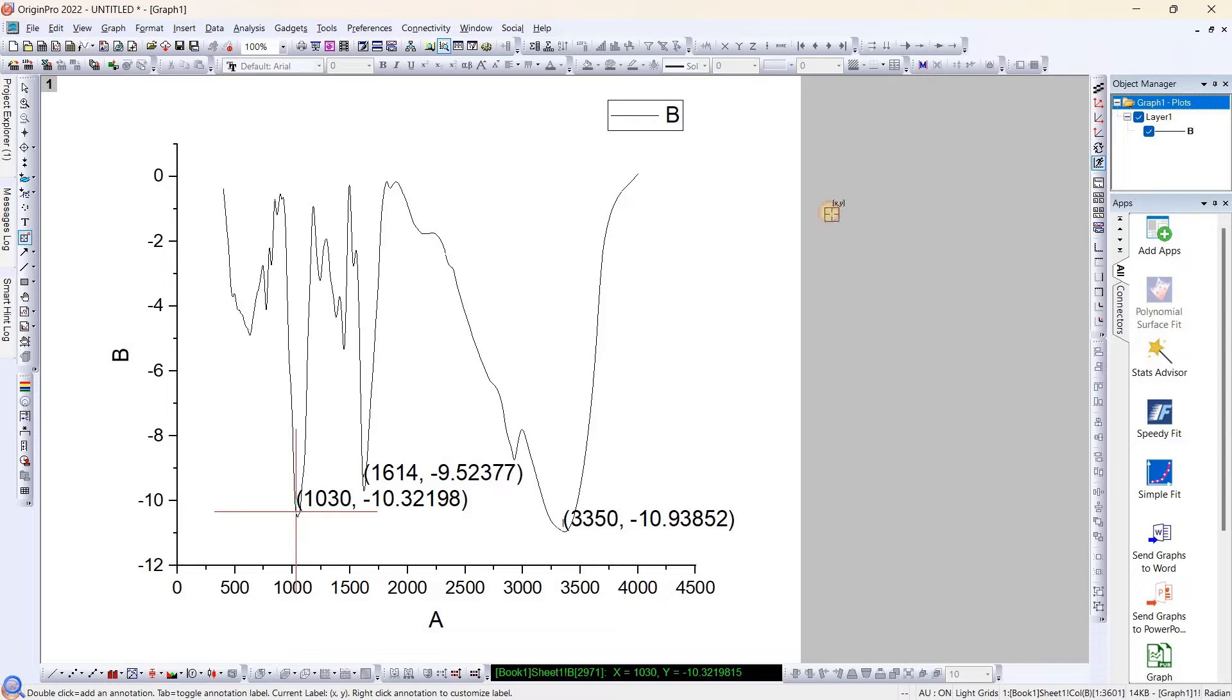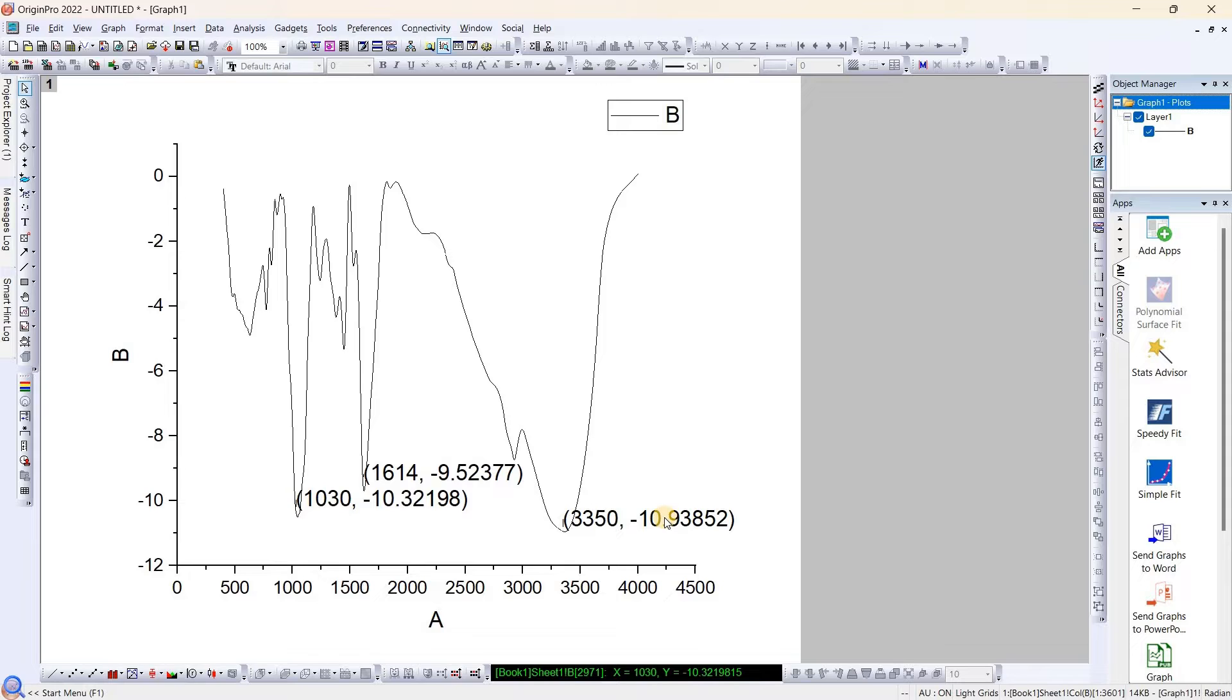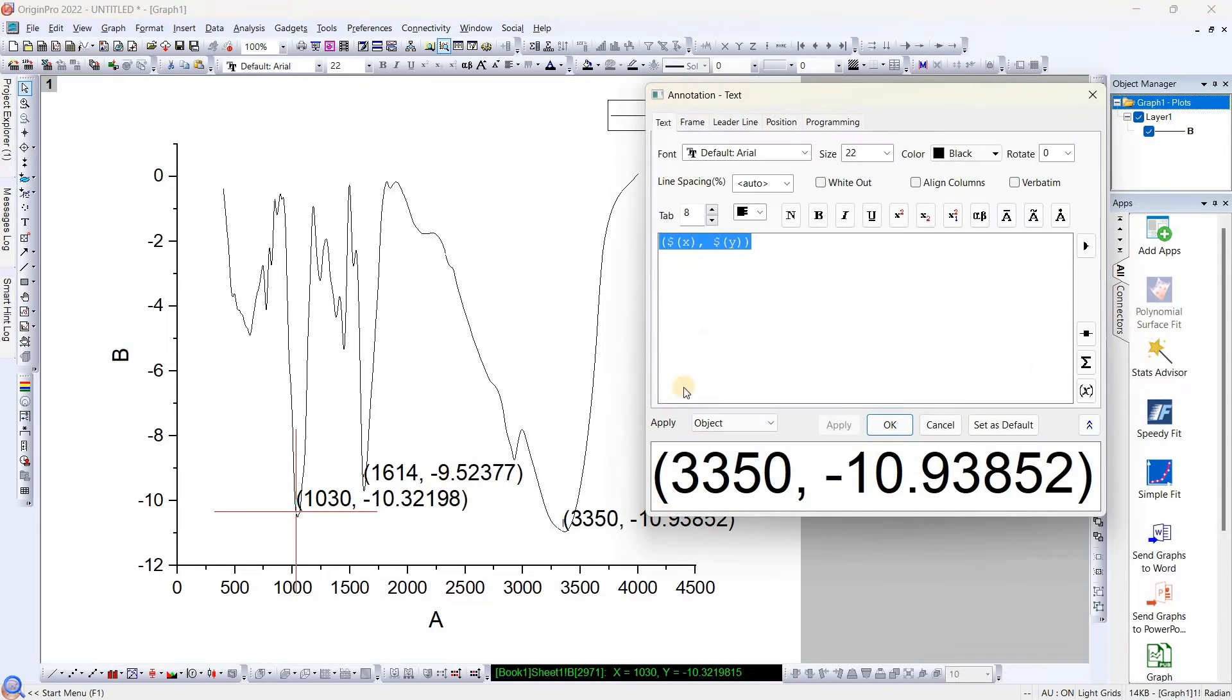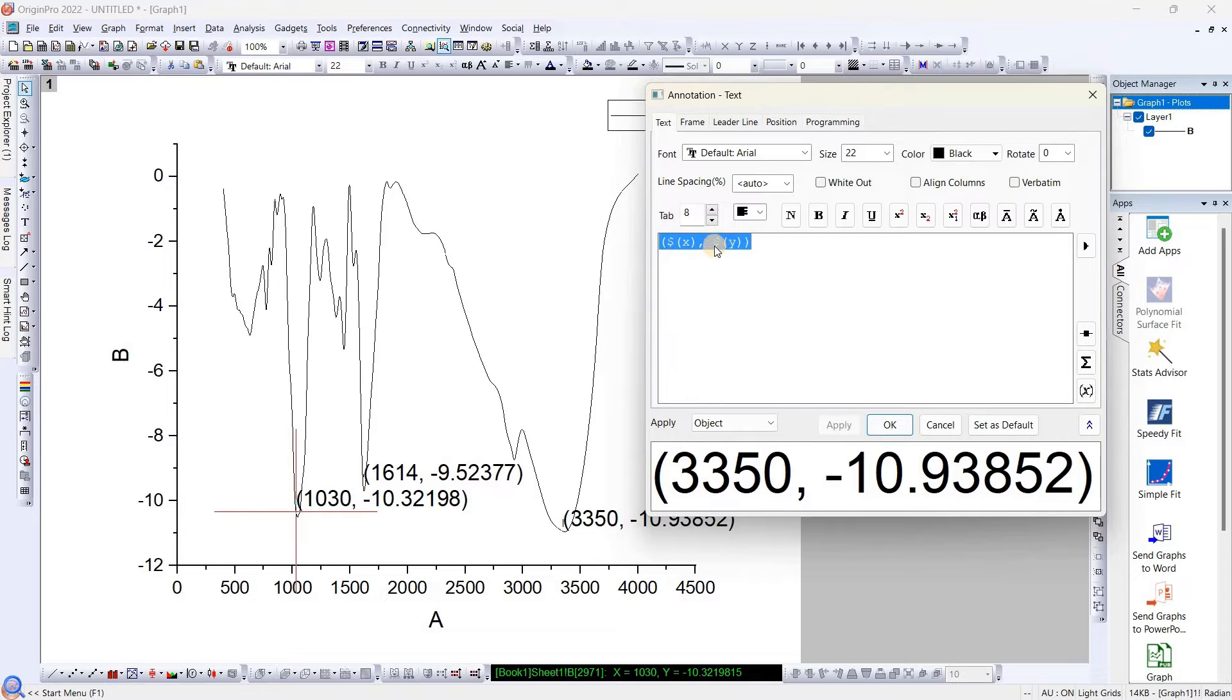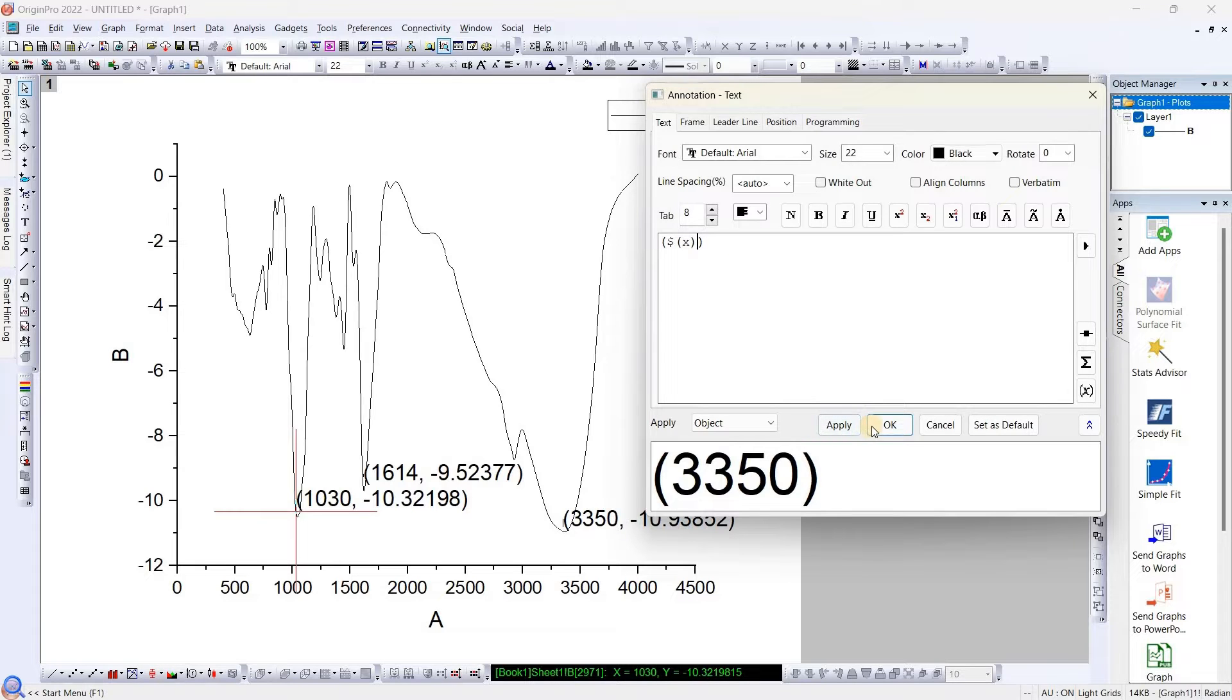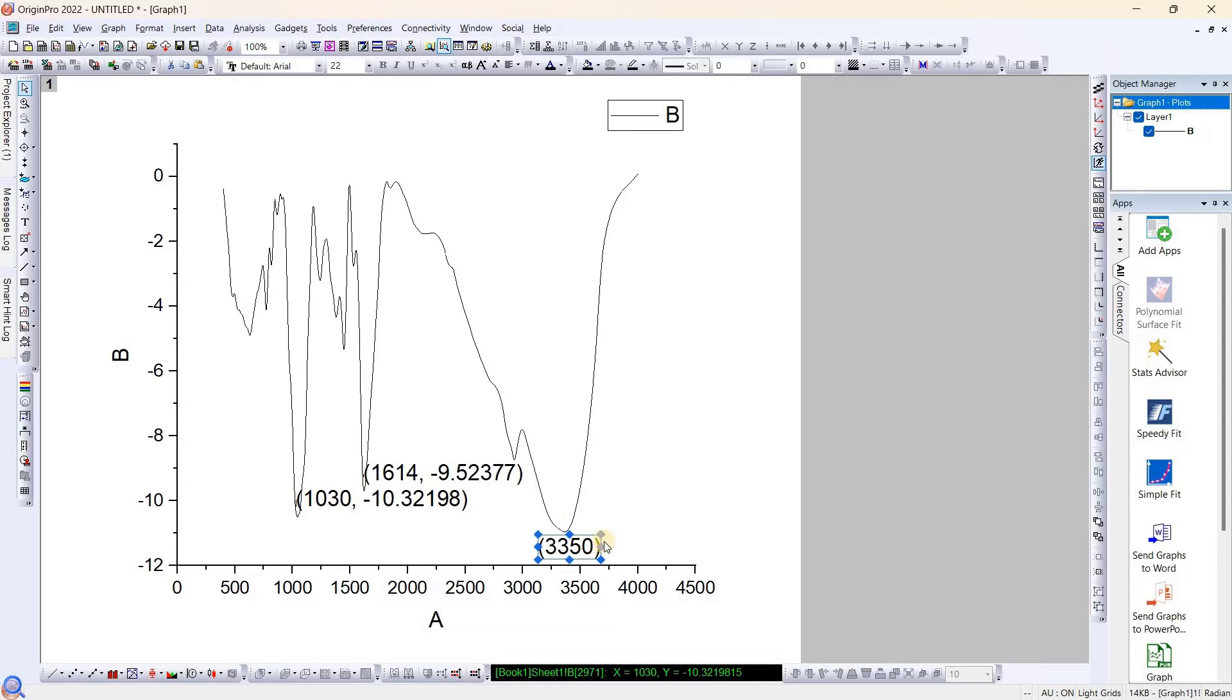Now what you need to do is you need to remove this y value. For doing that, you need to select this one. As you can see, this is the dollar sign y value, so you need to remove this one. Once you've done this, click OK.